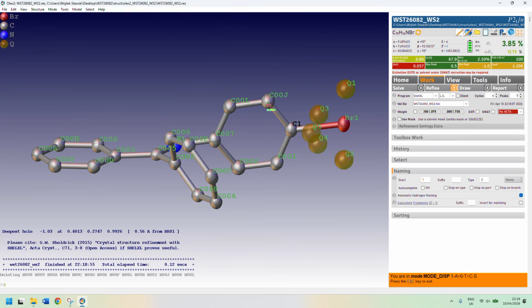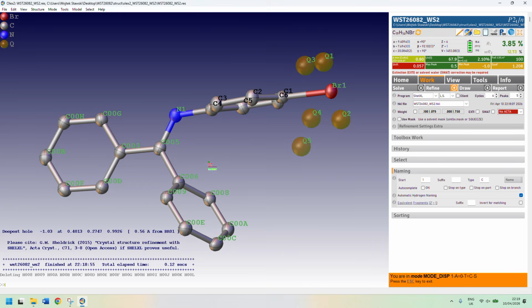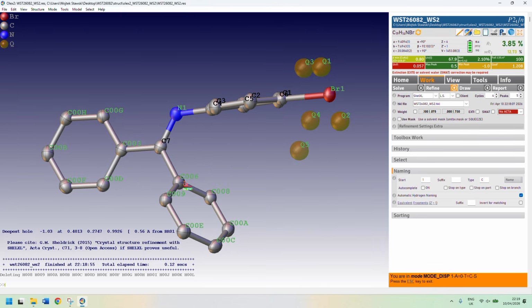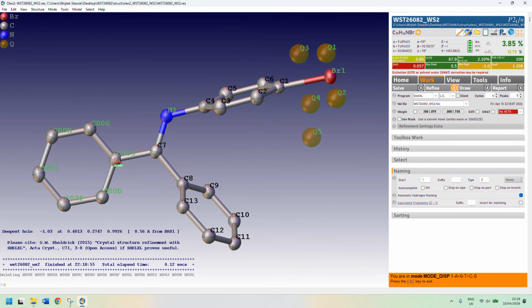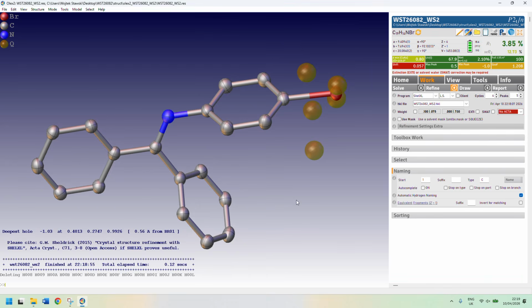It's not really necessary to name that, but firstly, when you leave these labels that are created by Olex, you'll get a G-level alert, but still an alert in checkCIF, and also some reviewers might not like it. Another reason why you should generally do that is that, especially if you have disorder, then it's much easier to write restraints and stuff like that when you have a very nice numbering scheme.